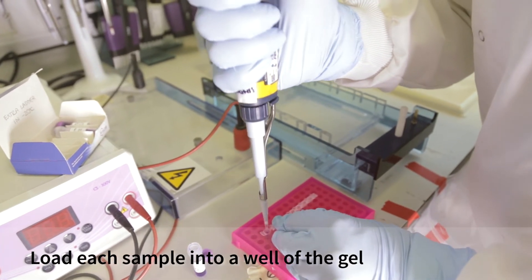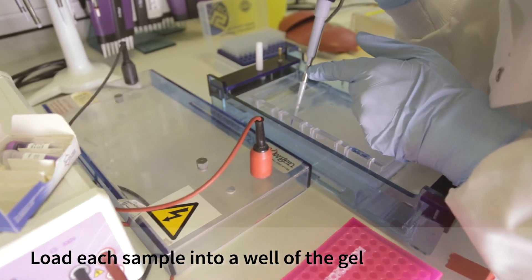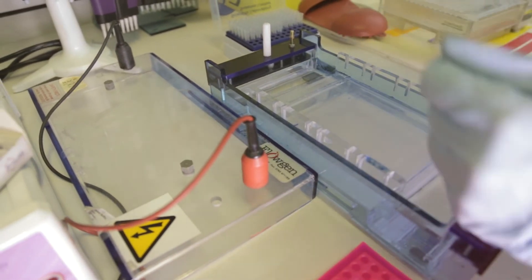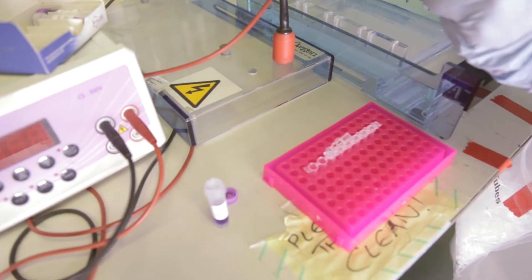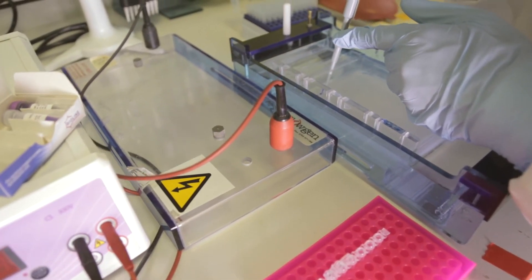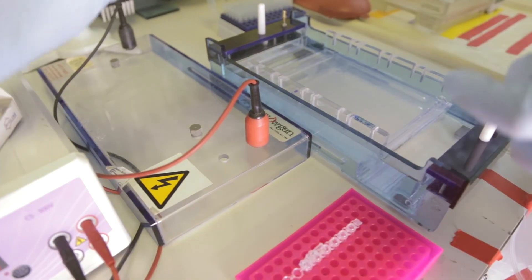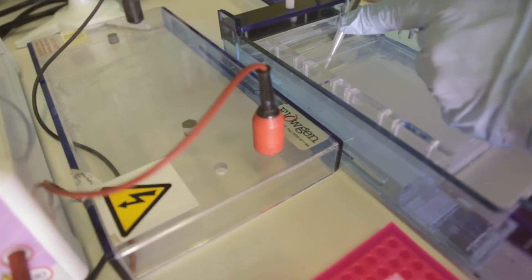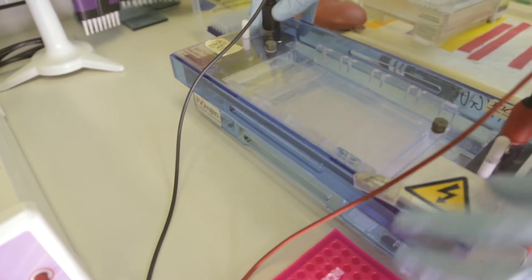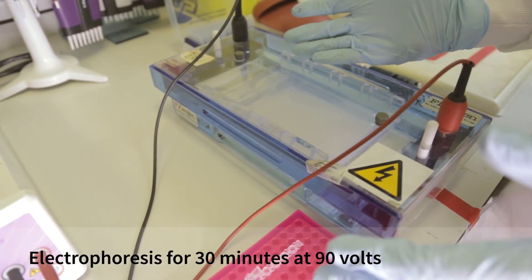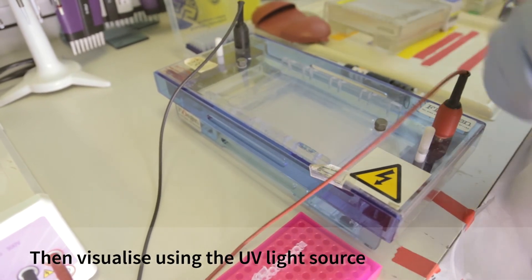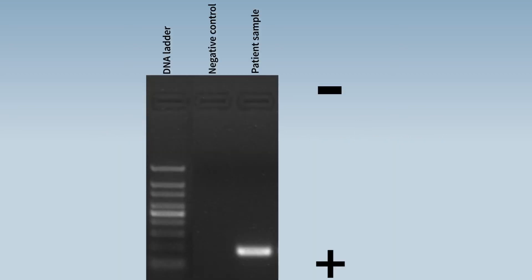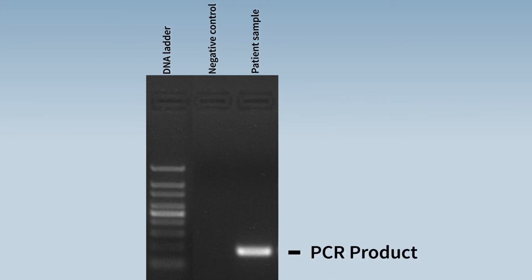We now load our PCR reactions into the gel — first our negative control, then our PCR product containing the APC gene, and we also add a small amount of ladder to enable sizing. We pass a current through the apparatus and leave it for around half an hour at 90 volts. The results of the gel run show the DNA has run from the top to the bottom. On the left we can see the DNA ladder. Our PCR product has run down to a size of 120 base pairs, as expected, and next to it our negative control is blank.